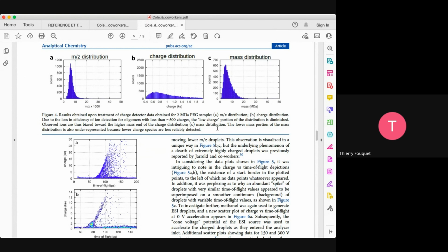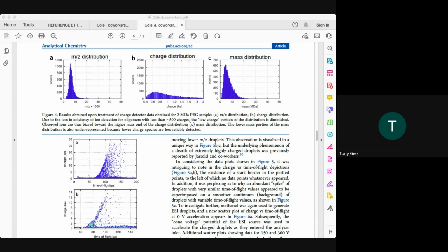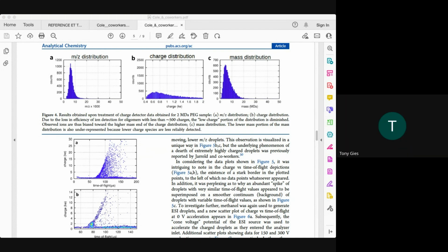Yeah, sure. Just out of curiosity, is there any way to overcome that 500 charge limitation, or not presently? Well, yeah, it would be to improve the shielding on our instrument and go to even lower noise components. It's really electronic noise that we're up against.